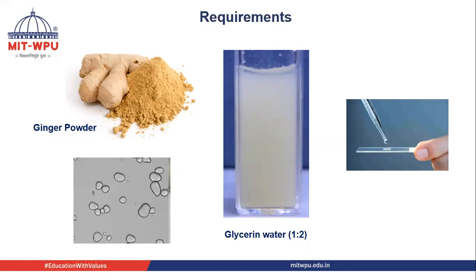Now, to determine the diameter of starch grains, we take ginger powder. Diluting it and observing under the microscope reveals ginger starch grains. We can also make a suspension and add iodine — the starch grains will turn blue color, making them easy to identify. Take a pinch of ginger powder in a test tube, add glycerin and water in a 1:2 ratio, make a suspension, then place a drop on a slide, spread it, and observe under the microscope.